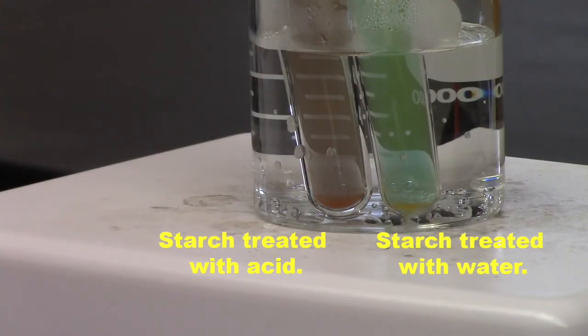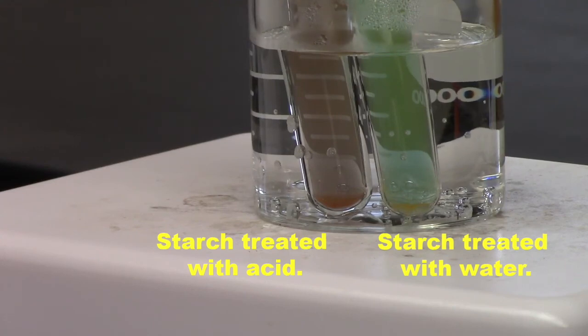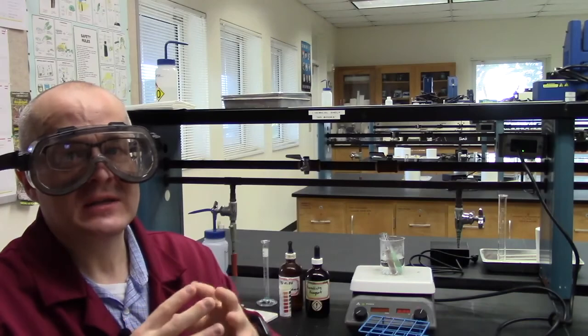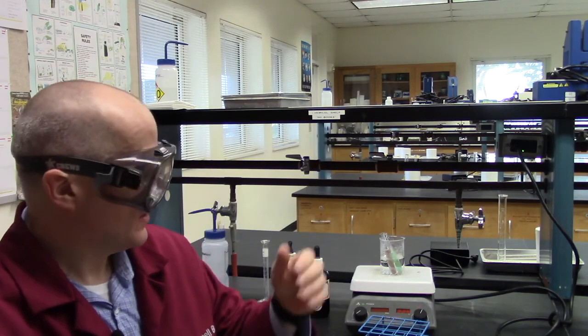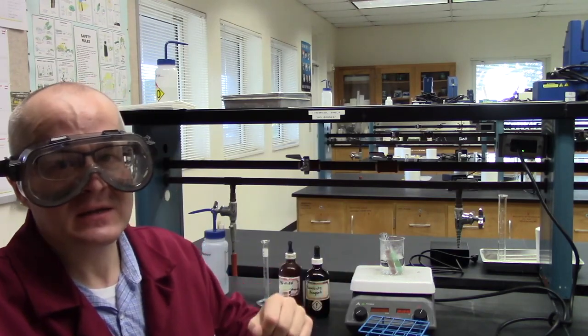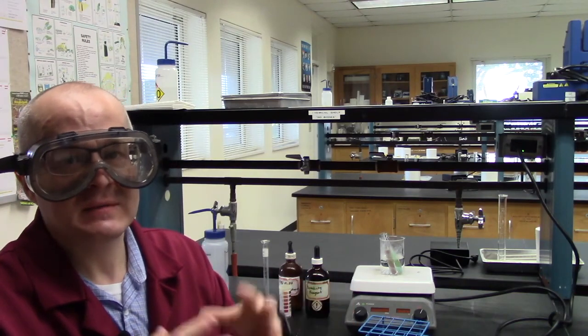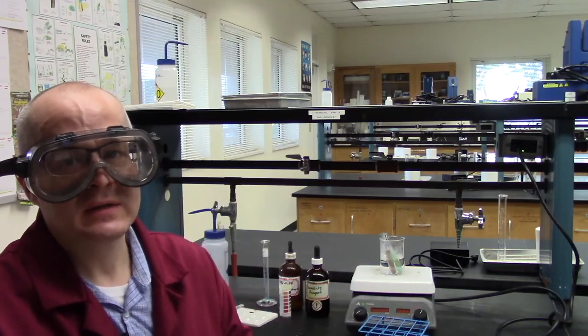The glucose is definitely turning brick orange or brick reddish orange. That's a positive test for glucose, so that's really kind of cool. The acid solution in starch, after heating it for about 10 minutes in near boiling water, the starch digests into glucose molecules. And then the glucose molecules we confirmed using a Benedict's test. The Benedict's test for glucose told me that this is most definitely a digested starch with glucose present. Isn't that kind of cool, guys?